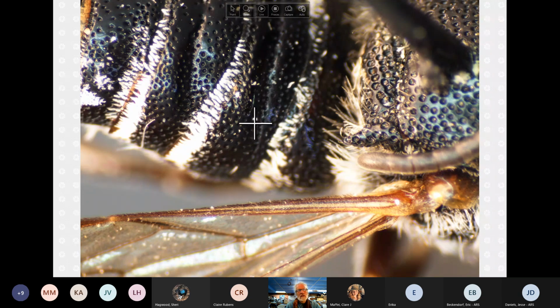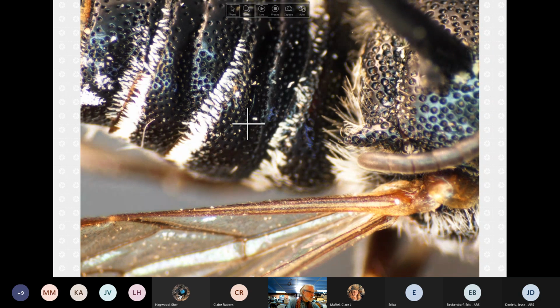It's difficult to see here because it's all dark, but this is an oblong shape, sort of like the size or shape of a grain of rice kind of thing. And inside is darkness and no additional pitting like here. You'll see other species have about the same shape, a little wider, and pits inside of it. Let's see if I can get a slightly better view of this.